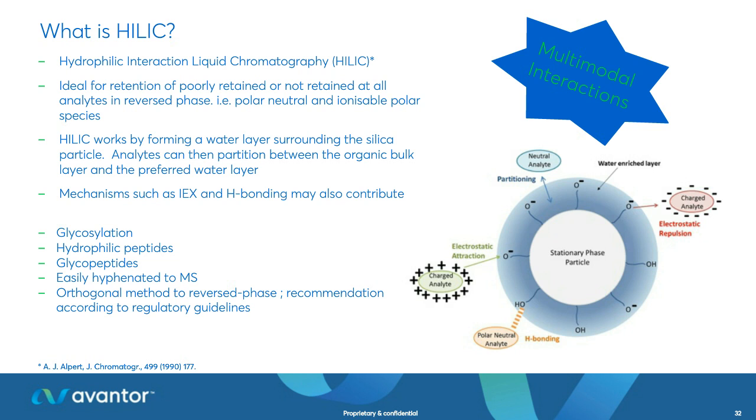So HILIC is not a new technique. It's been around since 1990 when Andrew Alpert coined the phrase. And it works by retaining more polar analytes. Really been used a lot for small molecules, but I have seen some work for glycopeptides, glycoproteins as well. So you could consider it if you've got the right pore size for larger glycosylated proteins intact. Where we've seen that it's really of use is when you actually look at cleaved glycans.